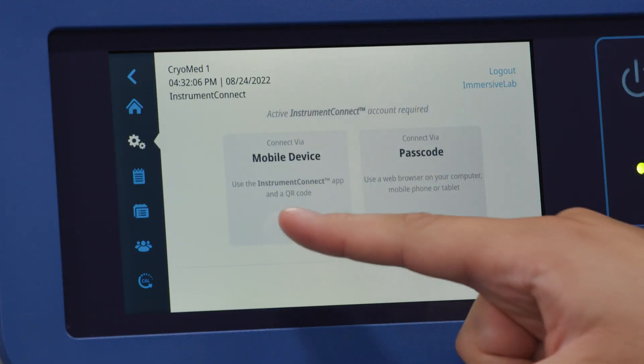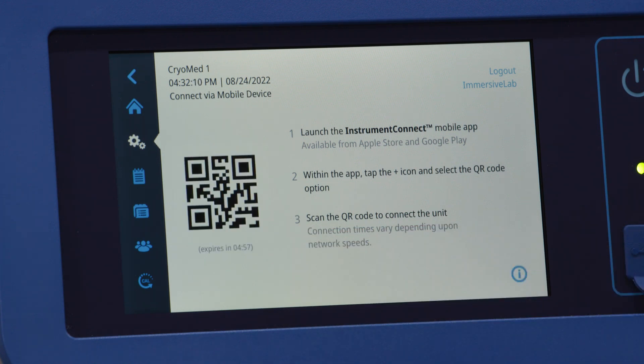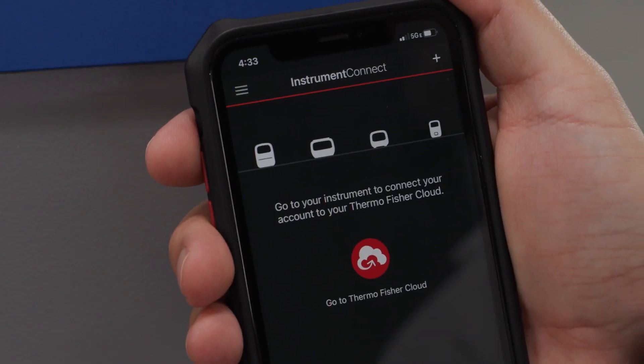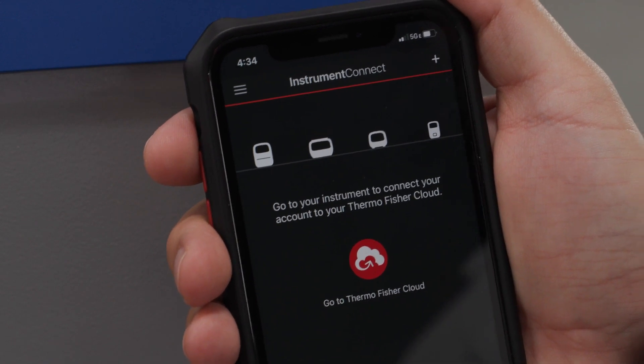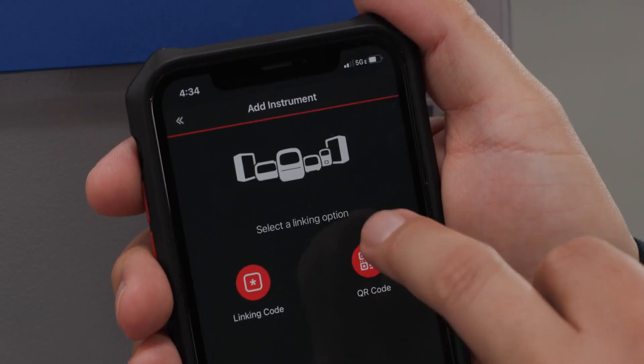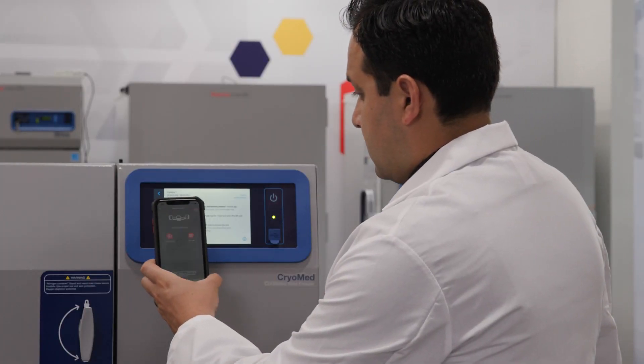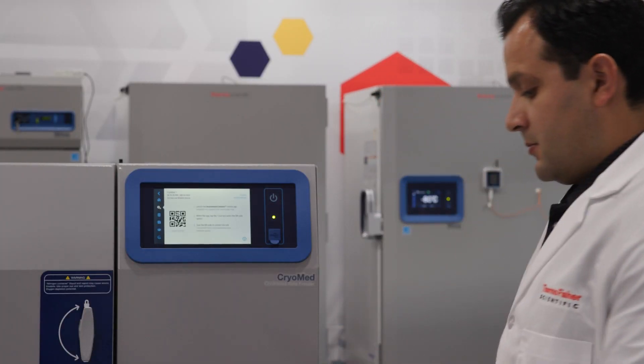You will now be able to monitor this unit and other compatible pieces of Thermo Fisher equipment remotely. The information consists of sample and chamber temps, profile run steps, comparing completed runs, and printing out a report. But remember, if your network password expires or changes, you will need to update this information in the Controlled Rate Freezer before it connects again automatically.